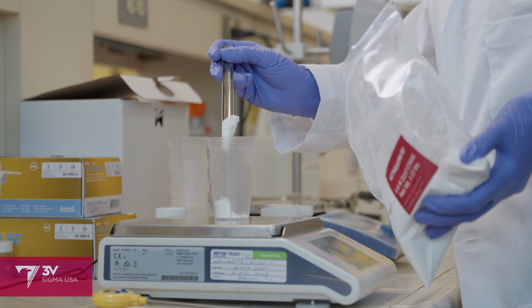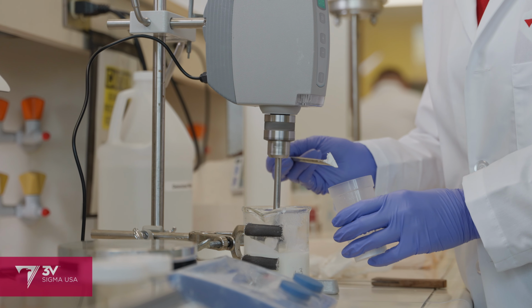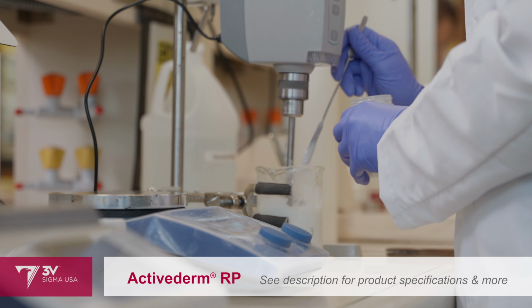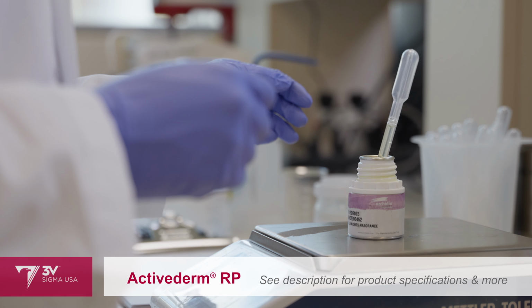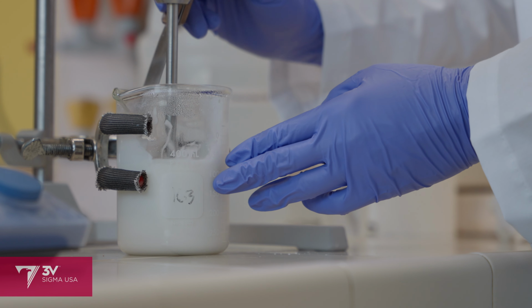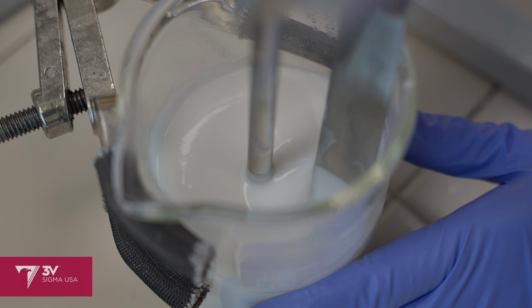Before finishing the batch with ashwagandha extract, preservative, and fragrance, I'm dispersing Active Derm RP. The fine rice starch particles glide on the skin and build on the soft, silky sensorial effect we were targeting with the ester cascade. We've made a stable, bright white, smooth emulsion.